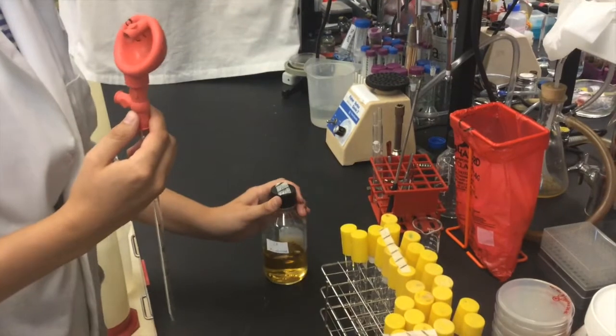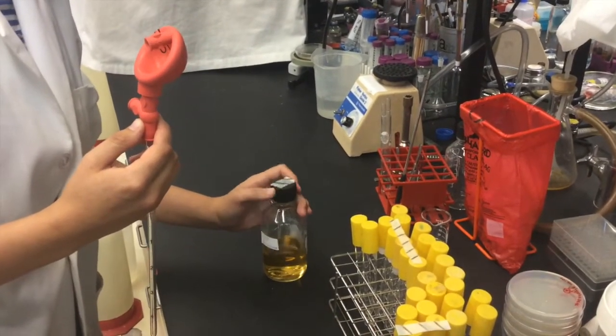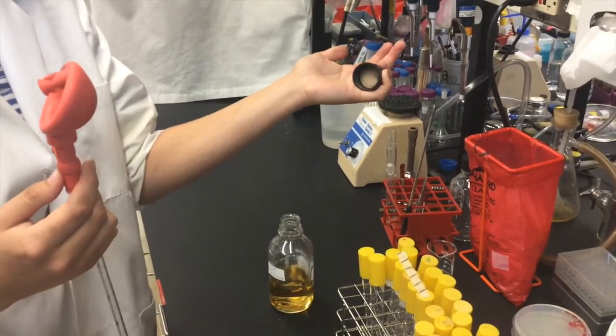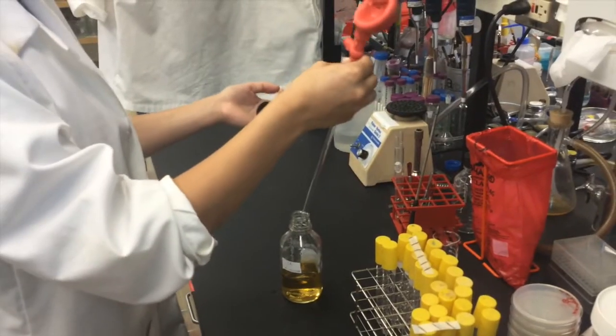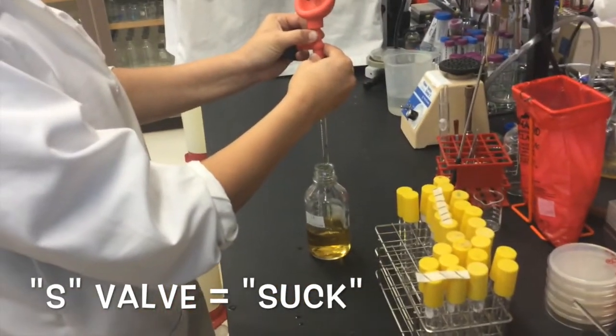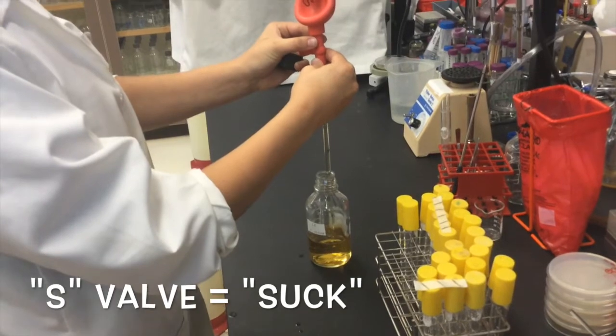Use your left hand to remove the cap from the bottle of LB. Use your pinky to hold the cap. Do not set it down on the bench. Press the S valve to suck up the fluid. Only hold it until the desired amount of fluid is in your pipette.